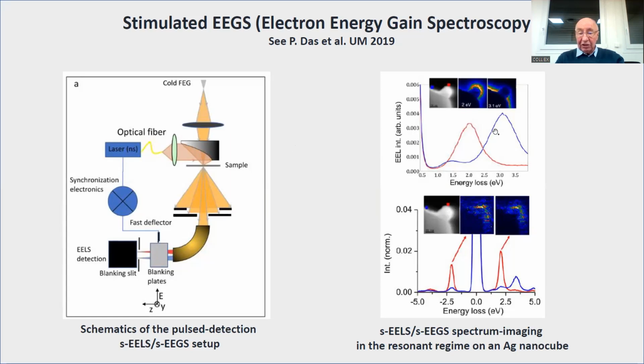These are two energy loss. But when you illuminate with the laser, it is excited, and when you look at the spectra at these two positions, now we have the zero loss, but we have the same structure on the energy loss and the energy gain. So energy gain, so we could now have access to all the domain of excited states and nanoparticles.